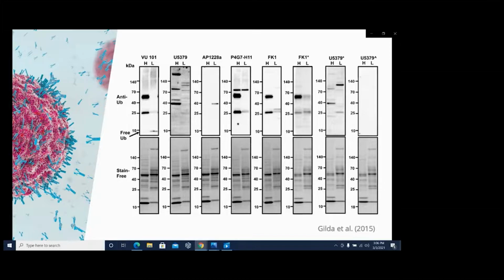Now, what I'm talking about here is not a unique example. We could spend this entire time going over examples of antibodies that are leading researchers astray. Take, for example, the figure here. What we're looking at here is antibodies that claim to bind ubiquitin in both the heart and the liver. Now, these are being sold across a ton of different vendors, and what we can see is that despite the fact that they're all binding the exact same target, they have completely different staining patterns, which indicates that they're actually binding completely different targets or a series of different targets.